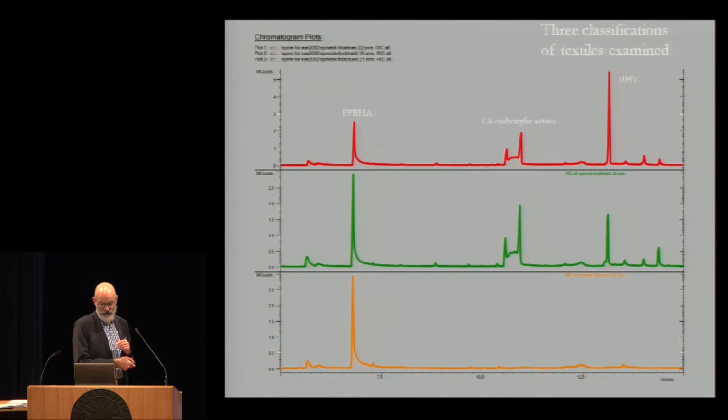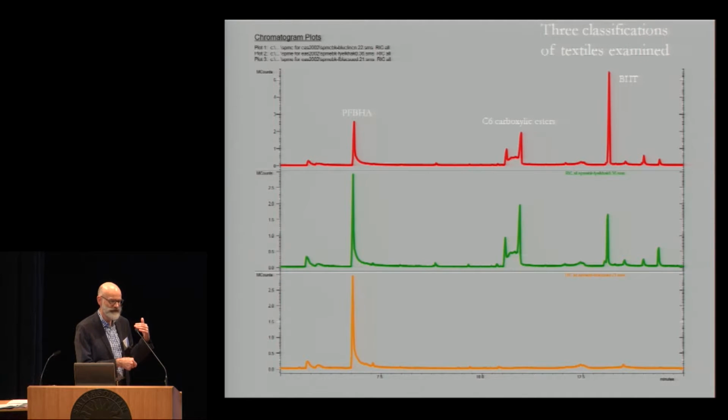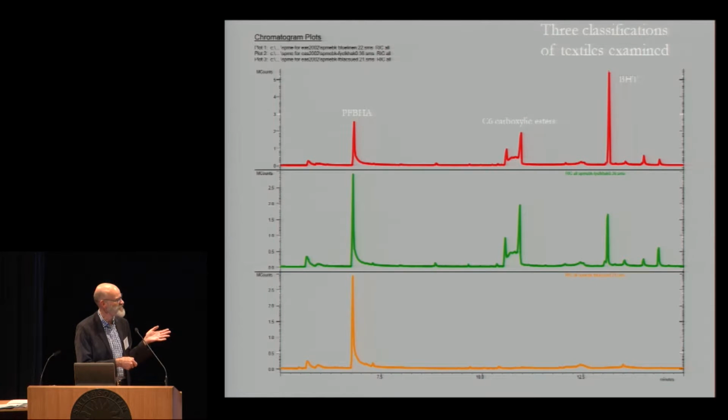Some textiles here, 3 different classifications that I tend to come up with when I do textiles. I think these are all runs of 6. So there were 6 or so that had this exact same profile, 6 or more with this one, and 6 or more with this. And the difference between these two is the amount, I'm assuming, of washing. There are all kinds of things that go into textile manufacturing. And so some of these prepared textiles I'm assuming have been washed in a certain way to reduce the amount of BHT, but they still have BHT. And then there are other textiles that we use or have used or have sampled that basically have nothing being off-gassed from them.